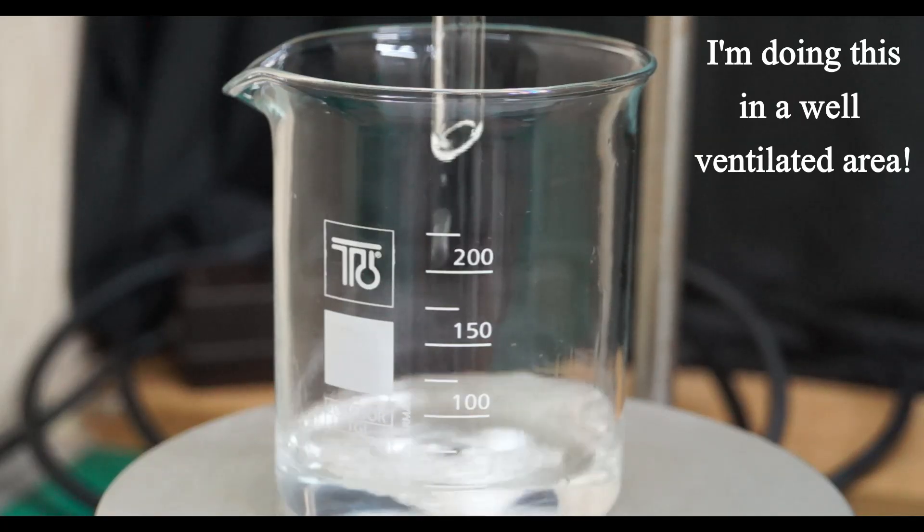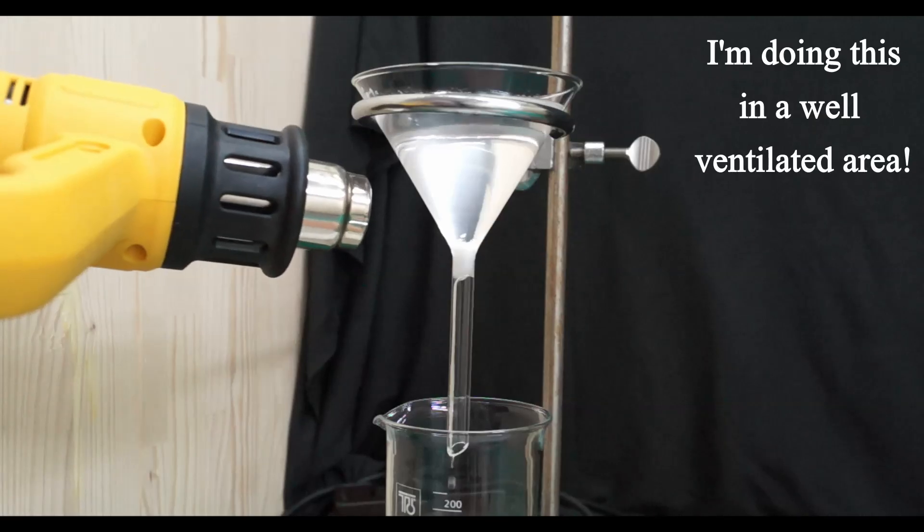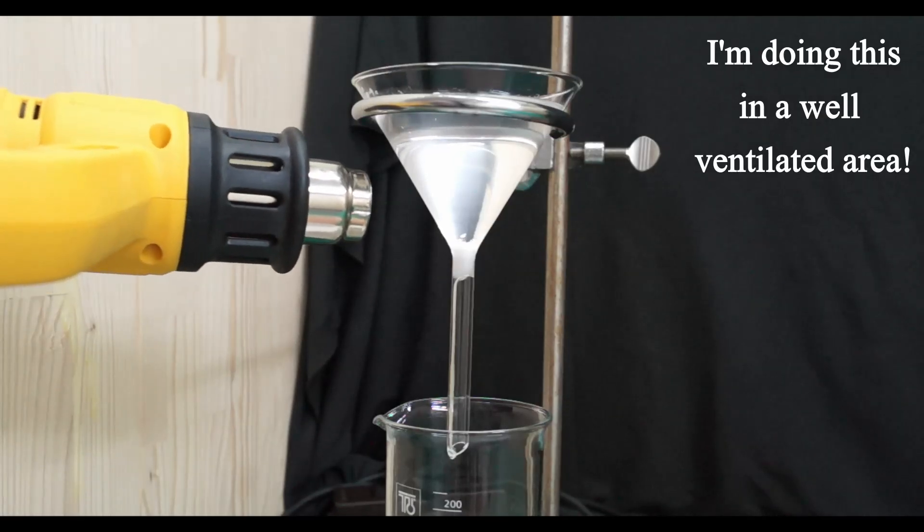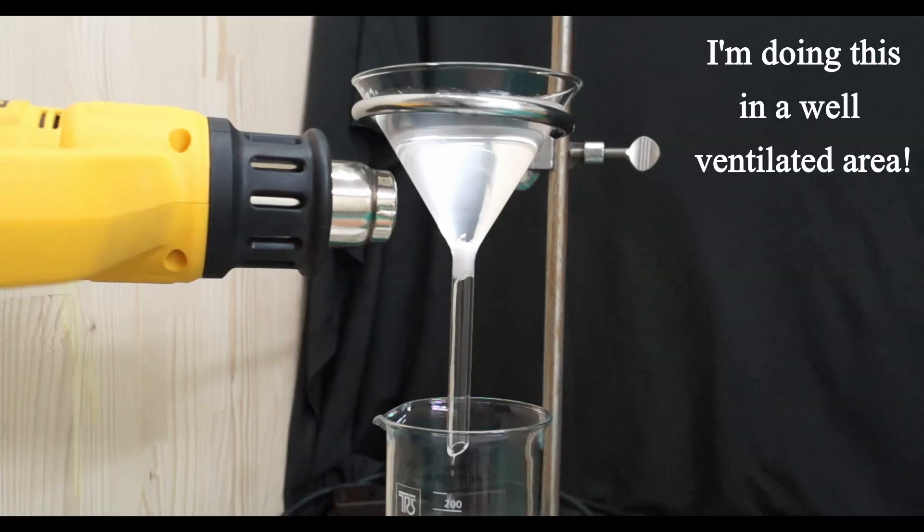So I decided to filter the hot solution again, this time through a small amount of cotton packed in a funnel and because this was going to be a slow process I also decided to start evaporating the acetone at the same time. During the filtration I used the heat gun to keep the solution hot and prevented the paracetamol from crystallizing in the funnel.